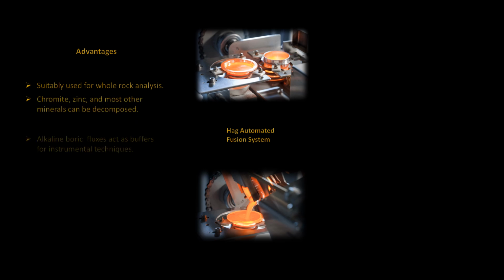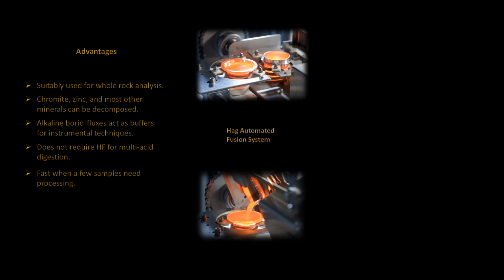The alkaline boric fluxes act as buffers for instrumental analysis and techniques, but may also apply to volumetric methods. Importantly, it does not require the use of dangerous acids such as hydrofluoric acid for multi-acid digestion of the fusion cakes. And lastly, it is rather a quick process when there are only a few samples to be processed.